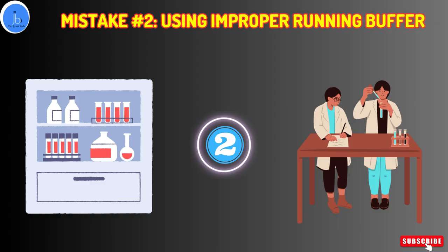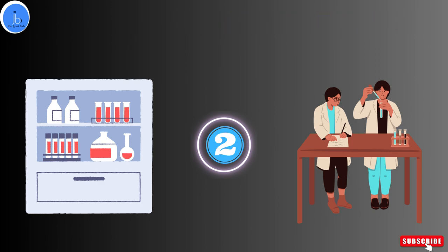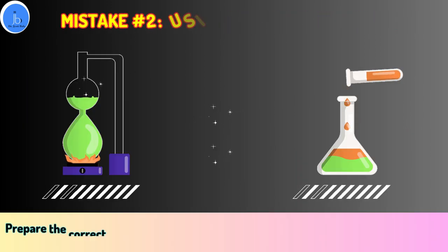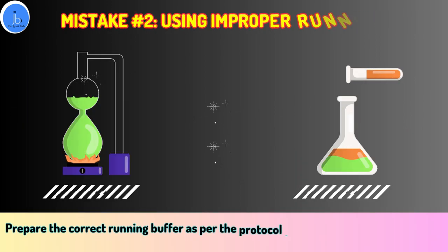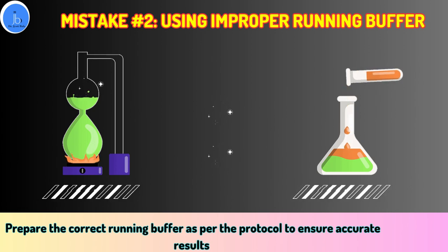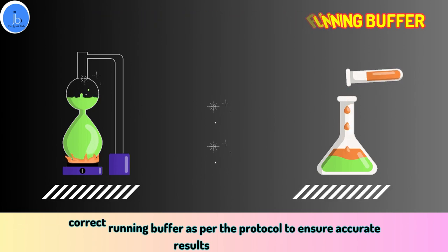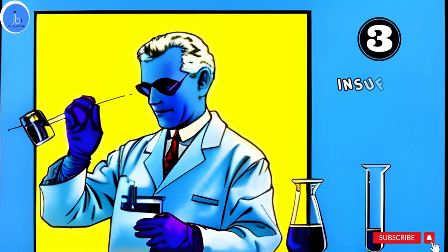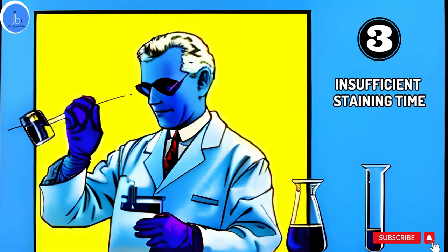The second mistake is using an improper running buffer. Using the wrong running buffer can affect the separation and migration of the protein. Make sure to prepare the correct running buffer as per the protocol to ensure accurate results.